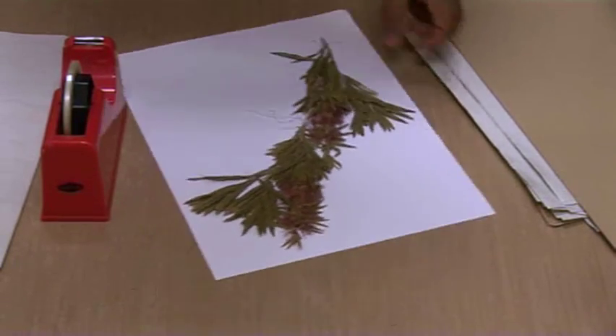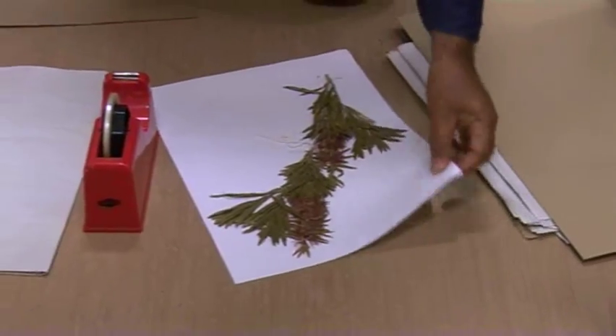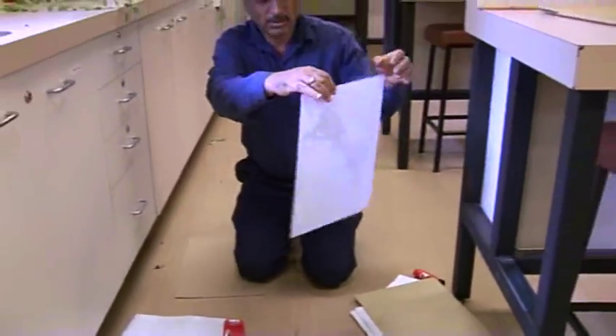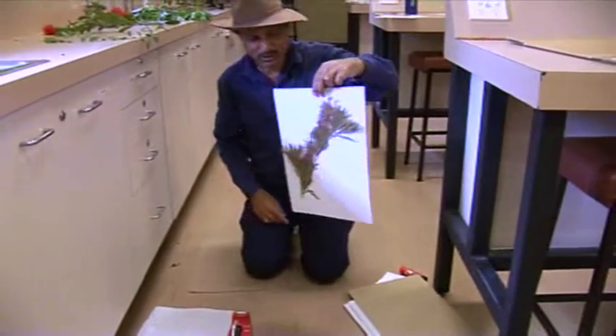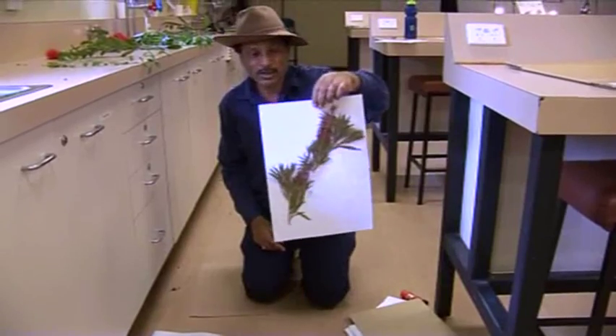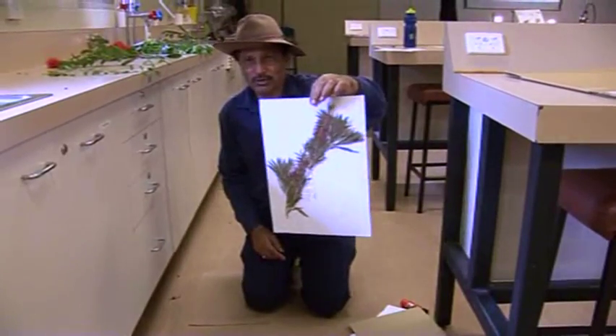The best way to test that is to hold this sheet and try to shake it. If it comes off, then it's not a good sort of mounting. Otherwise, this is perfectly fine.